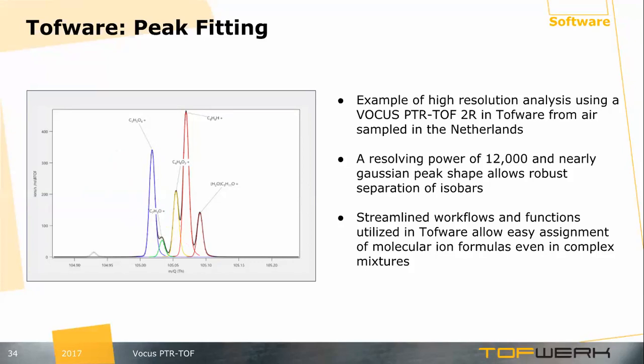And the peak fitting and peak identification process is basically taking these different bumps and fitting them with peak shape corrected peaks, and then taking the center, so using the mass accuracy of the instrument to identify possible elemental compositions, and then selecting these and fitting the high resolution time series. And so this is all done in a graphical interface with a predefined workflow so that you can step through your analysis efficiently.